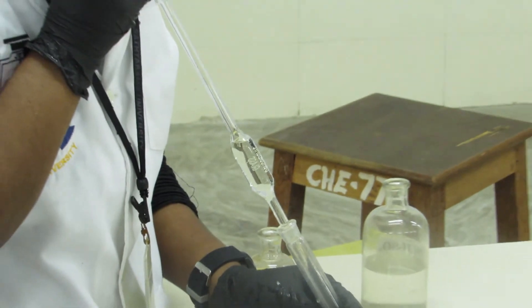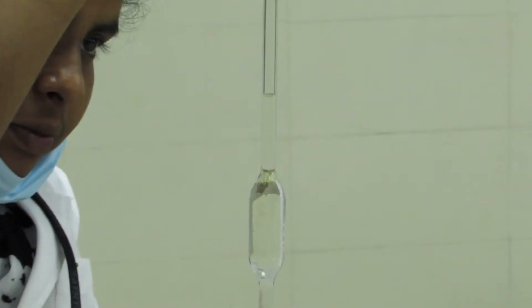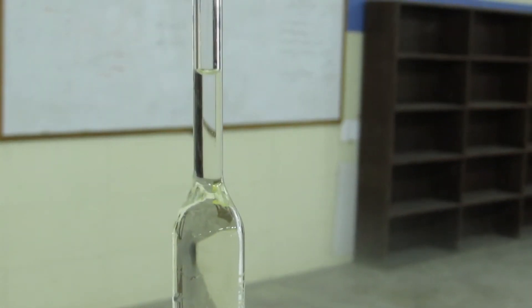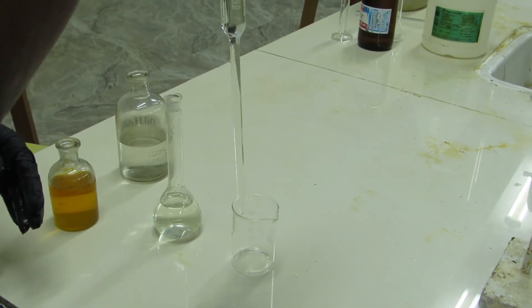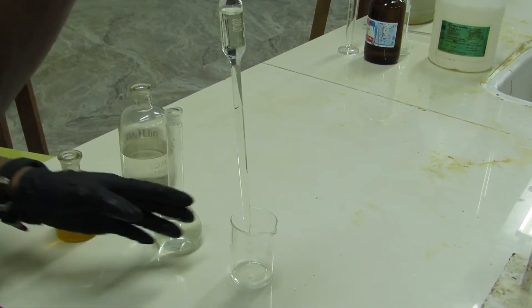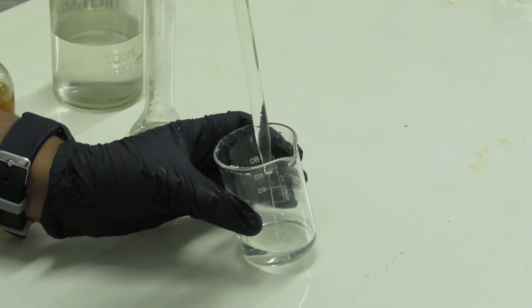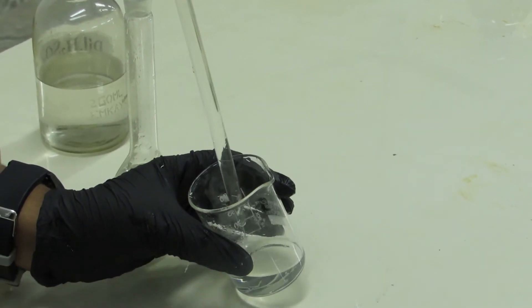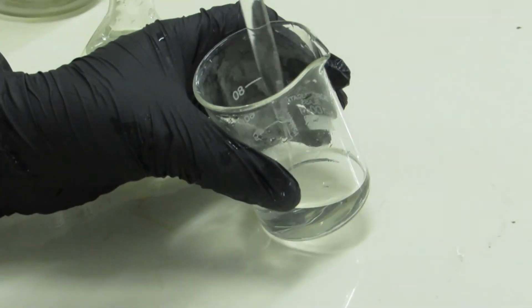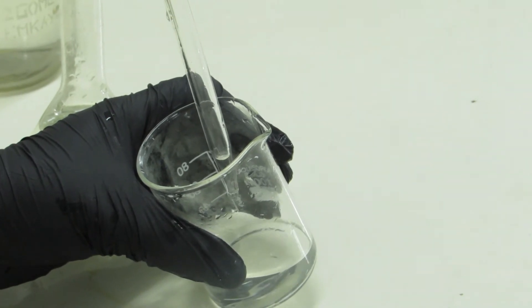From the prepared iron solution, we are pipetting 20 mL of iron solution and transferring it into a 100 mL beaker. 20 mL of ferrous ion solution we are transferring into the 100 mL beaker. Once you transfer the iron solution, we have to add 20 mL of dilute sulfuric acid. We are adding 20 mL of dilute sulfuric acid to this.